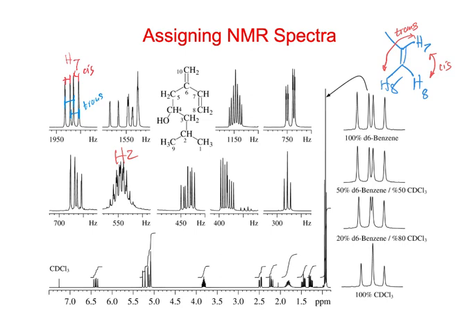So if we wanted to find a peak that's down in this range that matched these, we could take that blue coupling that I drew out there, and see where it matches in this spectrum. So what I used to do is just take something like this because I'm old-fashioned.